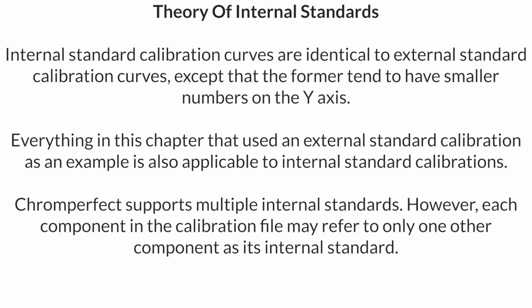Internal standard calibration curves are identical to external standard calibration curves, except that the former tend to have smaller numbers on the y-axis. Everything in this chapter that used an external standard calibration as an example is also applicable to internal standard calibrations. Chromperfect supports multiple internal standards. However, each component in the calibration file may refer to only one other component as its internal standard.